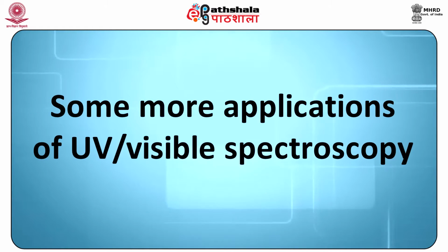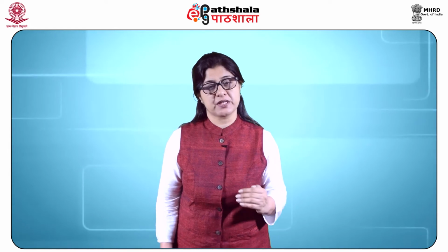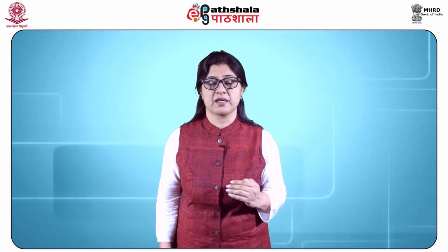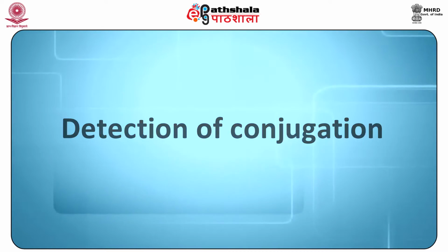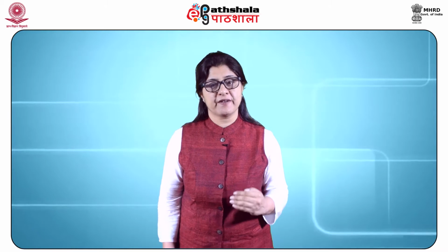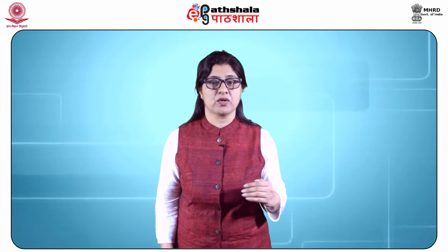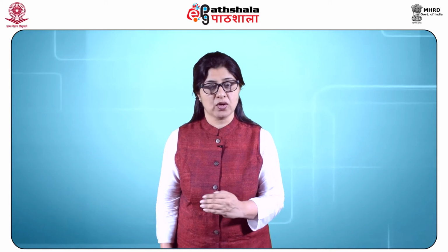Some more applications of UV visible spectroscopy are discussed. Detection of conjugation. With the help of an ultraviolet spectrum, one can find whether a given compound contains certain groups in conjugation with each other or not.